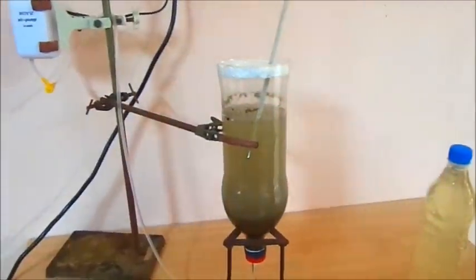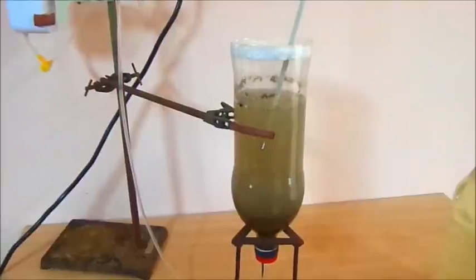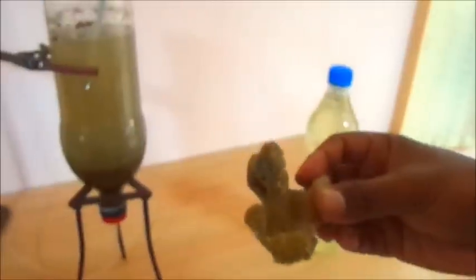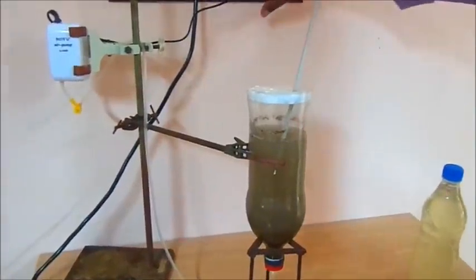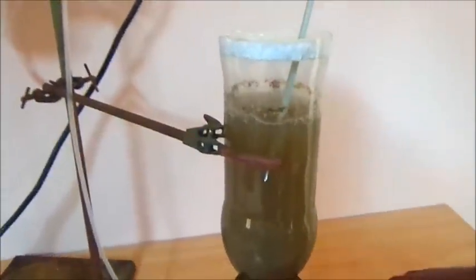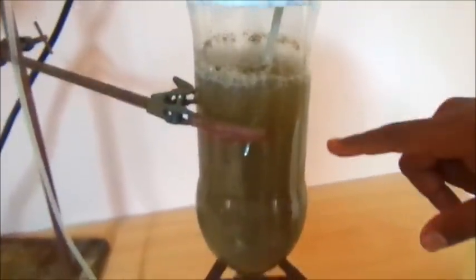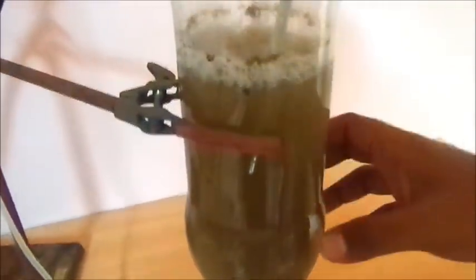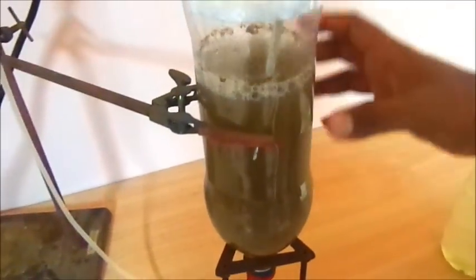Now let me explain the working of the fermenter. The fermenter bottle has been filled with waste water and marine sponges. The marine sponges have been powdered and added into the fermenter. Now the fermenter has been switched on. You can see the air bubbles pumping from the spager upward, and the dust particles evidence the circulation of the medium, achieving equal distribution throughout the fermenter body.